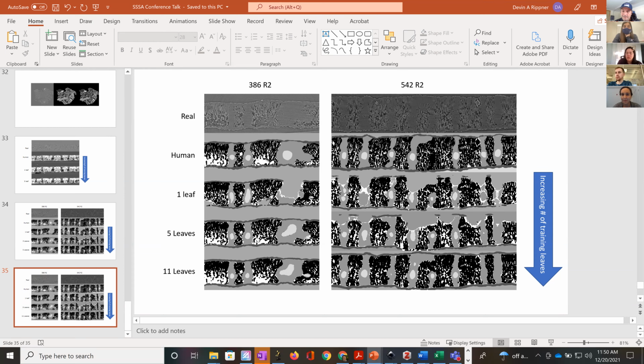If you're interested in dehydration or any type of stress or physical changes, you can trust the model. It can pick the volumetric changes well. Okay. Really nice. It's definitely getting veins a lot better than I've had success with the random forest. And yeah, it looks really good.